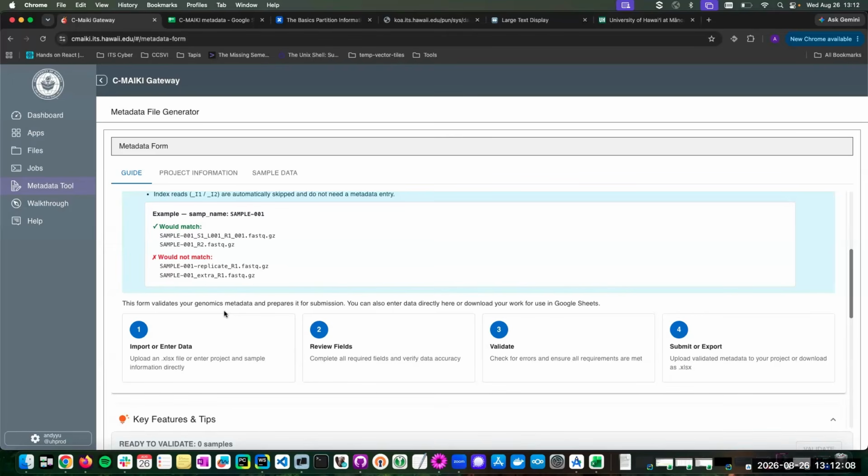Okay. So the way that the pipelines generally work, and I mean all pipelines, not just the one that we have implemented on the gateway, is they're usually, especially when they're dealing with Illumina, which again is a particular sequencing platform. And whether you use Nextera, meaning the Nextera branded double PCR combo that Illumina sells, or you're using the primers that were designed by the Earth Microbiome Project at UCSD, because they sequence after the primer, basically, you have to have different things. The Nextera primers anneal to the adapters, the sequencing primers. It's probably beyond the scope of today's discussion.